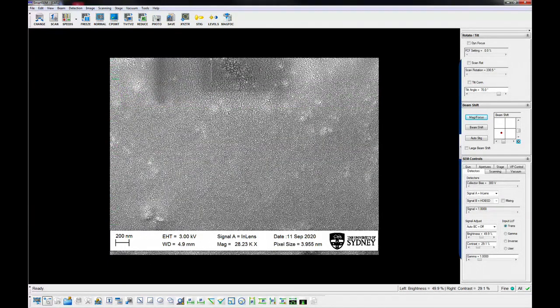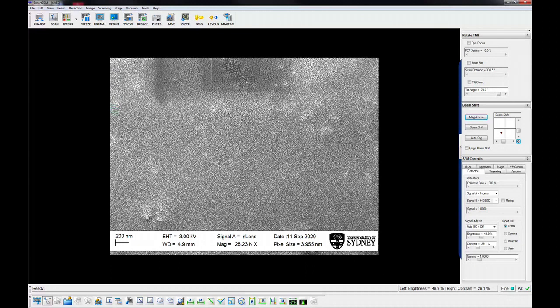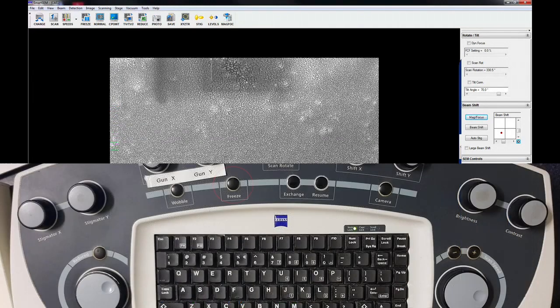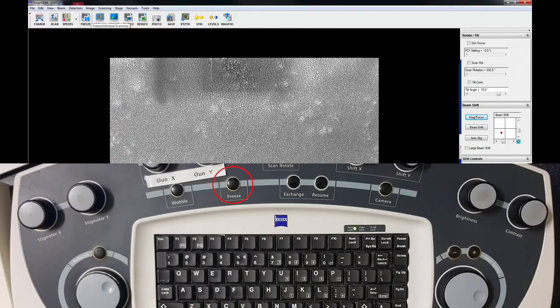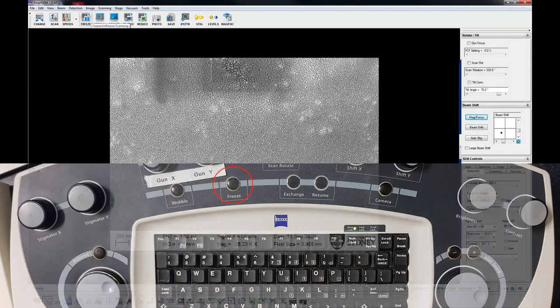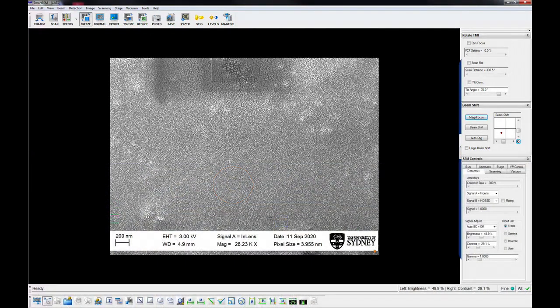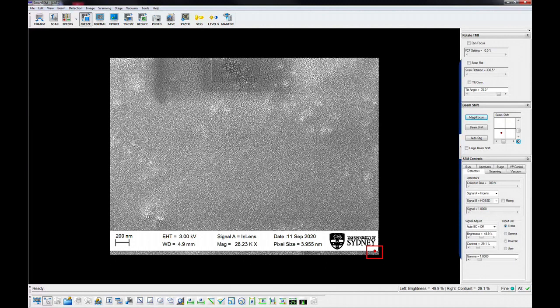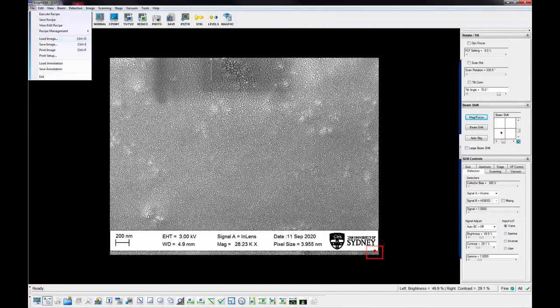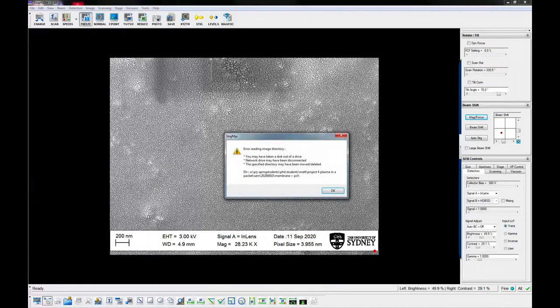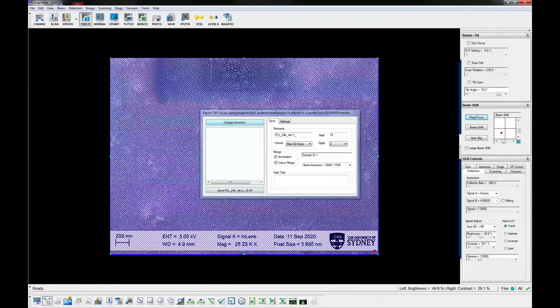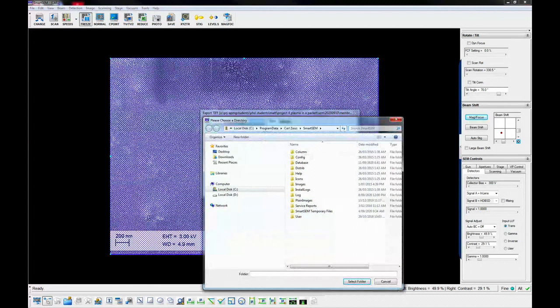Set the scanning option to freeze on end of frame. Press the freeze button. When the frame capture is complete, the orange indicator in the bottom right corner will turn red.